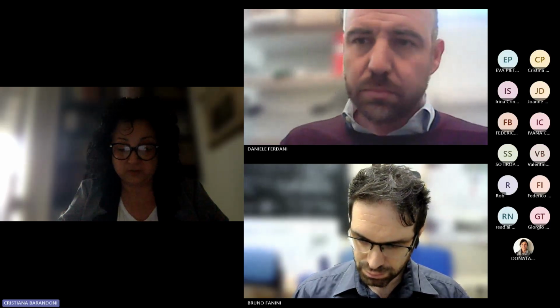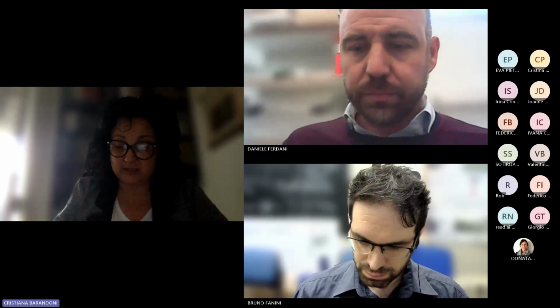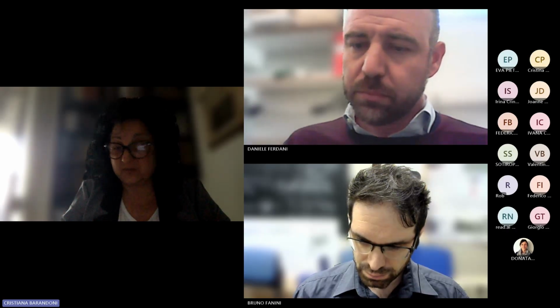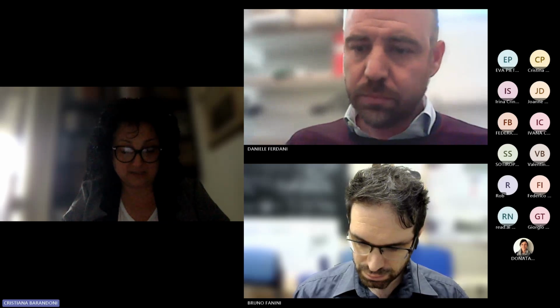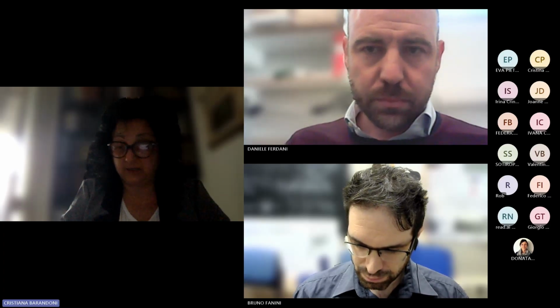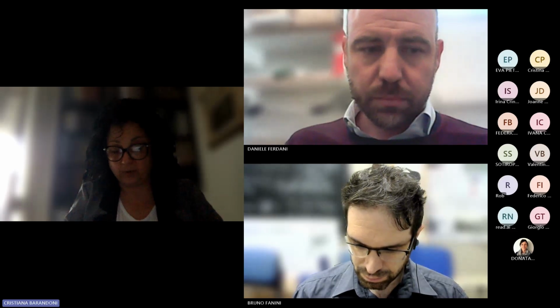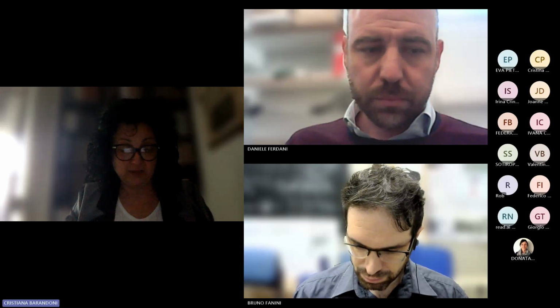Built on the open source ATON framework, MuLaX supports the interactive exploration of analytical analysis through a sophisticated annotation system for spot analysis such as microscopy, XRF, and FORS, and it also offers a multi-layer visualization for imaging techniques like VIL, UVL, accessible both thanks to lenses and split models.